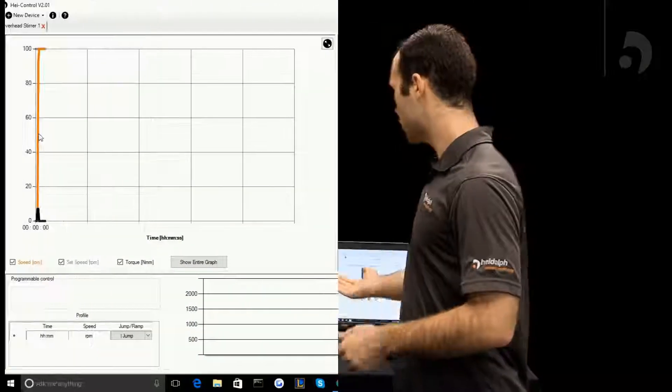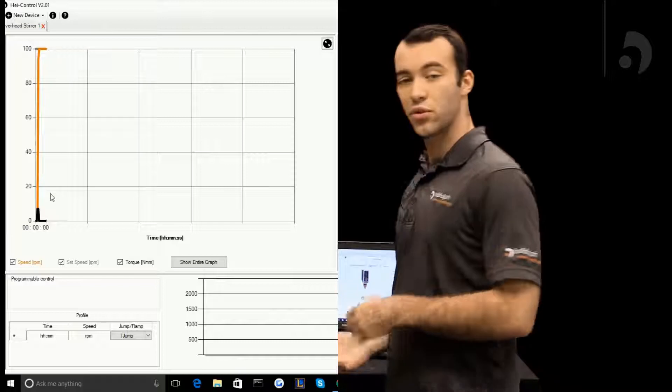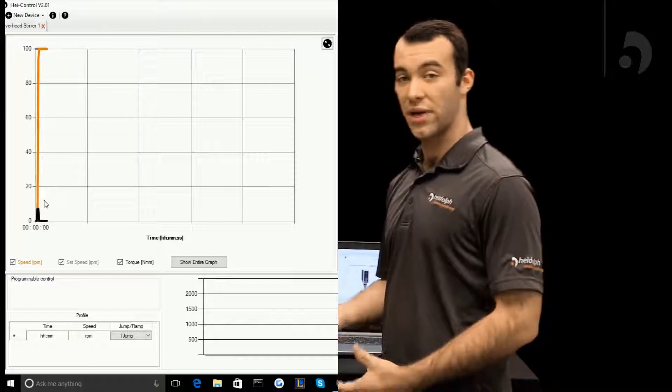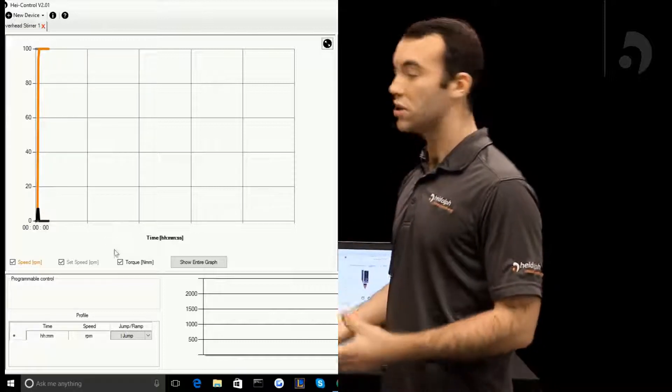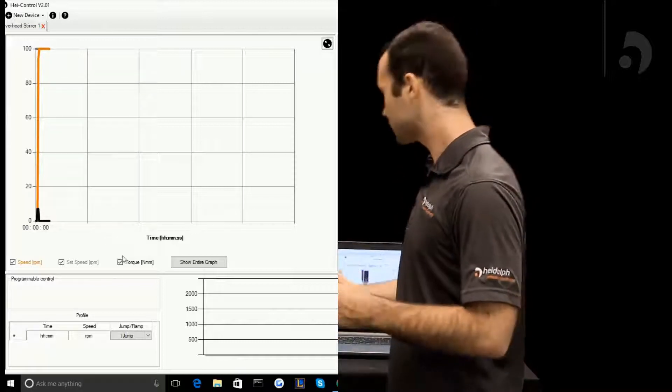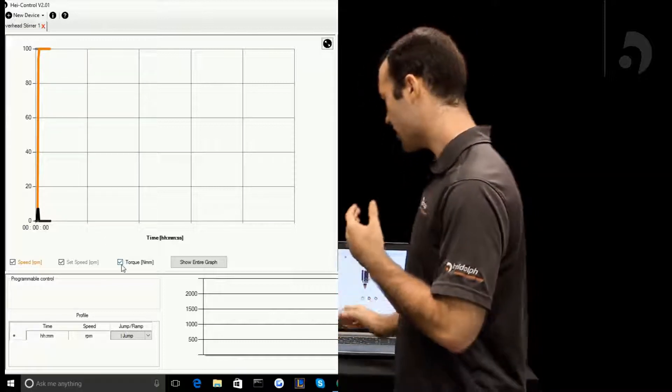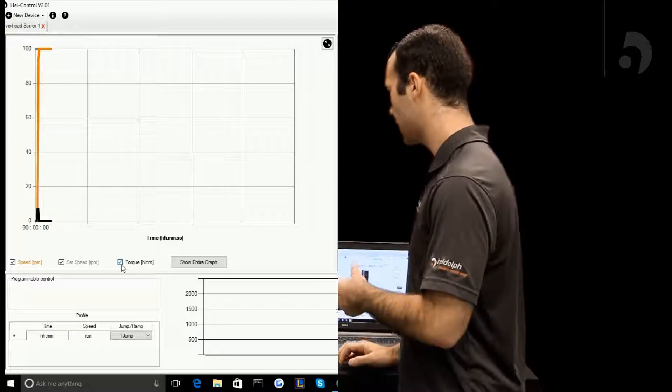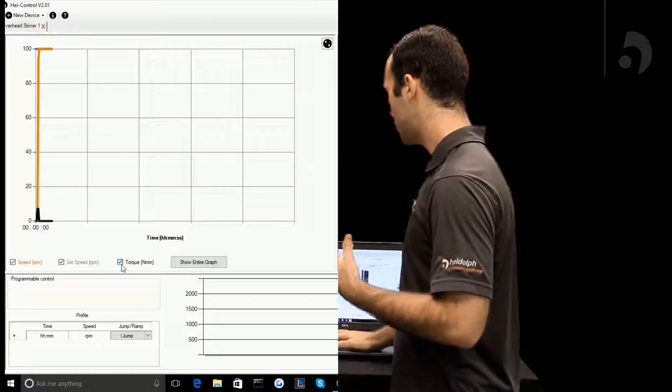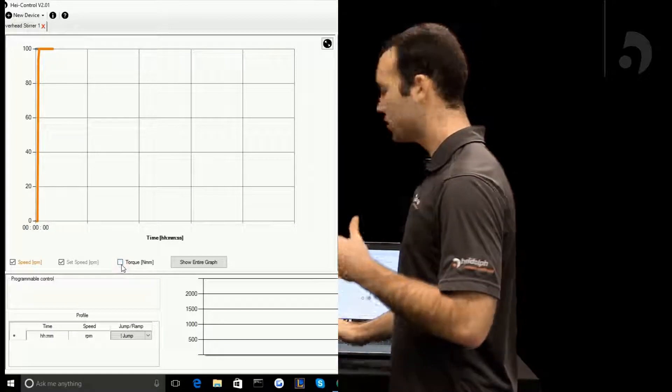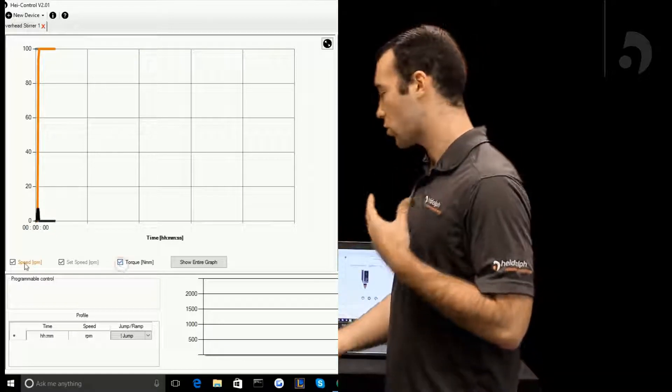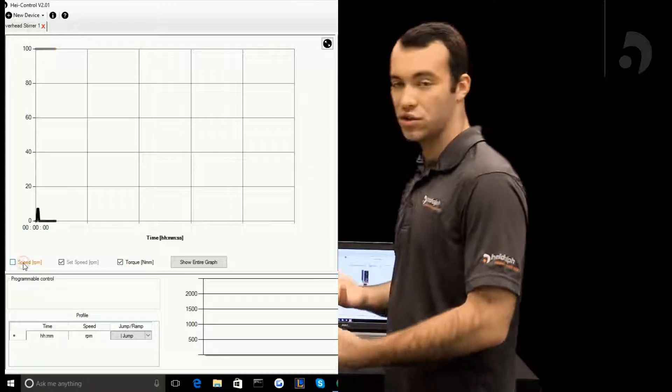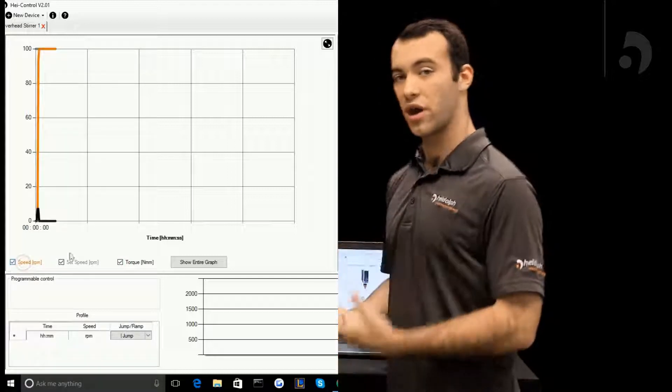You'll also notice on your software there's a graph that gives you real-time information on the torque and the rotational speed of your HiTorque. At the bottom of the graph you'll see that you can adjust it to either remove the torque or the speed in case you just want to see one or the other.